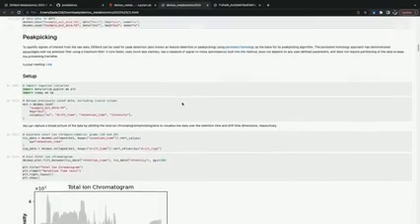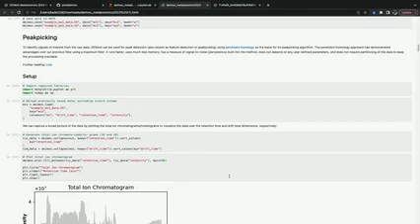So, in the previous section, we demonstrated loading and saving data, and so you can load one of the data files that was saved that corresponds to the MS1. When data is in the HDF5 format, you can specify a key to access which data you're accessing.